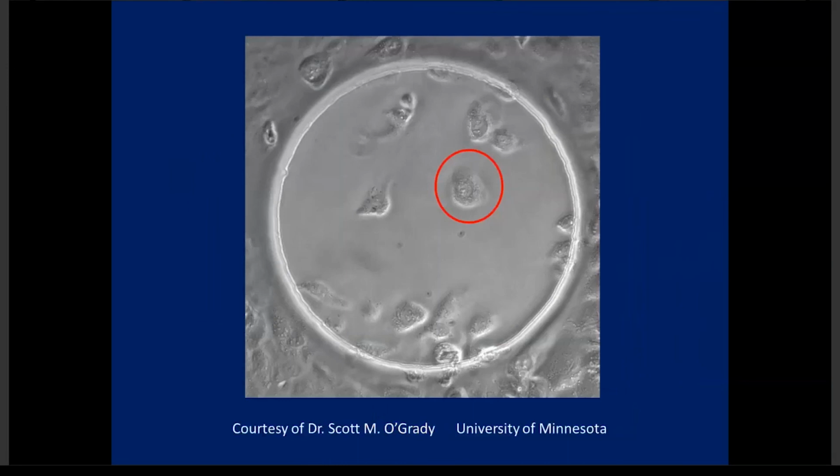For example, here's an electrode that's been wounded. We've attempted to clean it off, and you can see there are several cells still on the electrode surface. If you do time-lapse cinematography, you will see these cells are no longer alive. They're not moving, but they nevertheless are present and may block the incoming cells from occupying that spot, and they are not blocking the current very effectively.